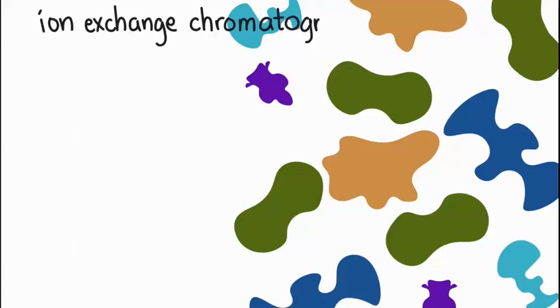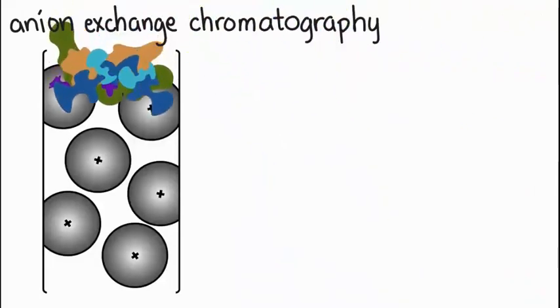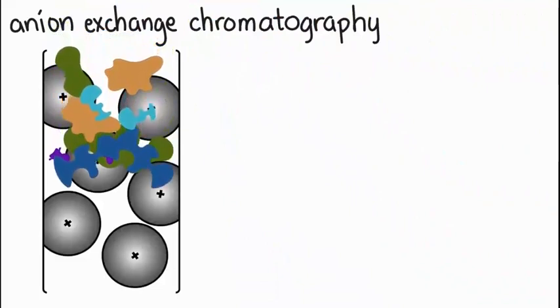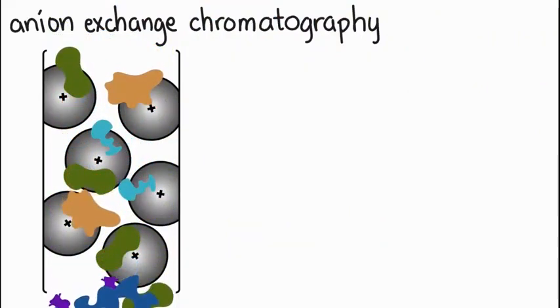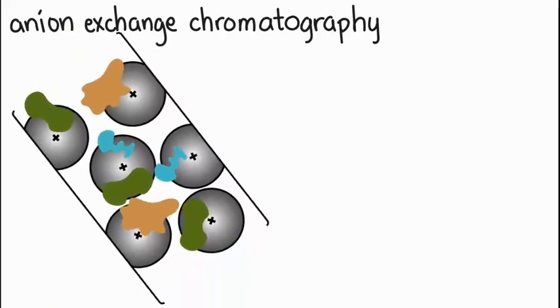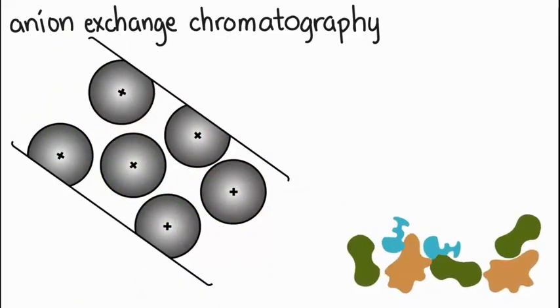What happens next if you perform ion exchange chromatography to separate proteins based on charge? In this example, you use anion exchange, where positively charged proteins flow off the column and negatively charged proteins, like beta-glucosidase, bind to the positively charged column. After you've washed off the positively charged proteins, you use an increased concentration of salt to release beta-glucosidase and other negatively charged proteins from the column and collect them.